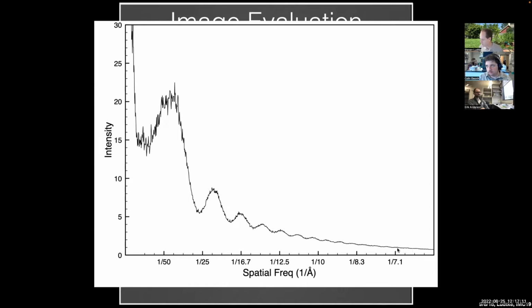So typically what's done in RELION and some of the other packages is a so-called flattening process, where you fit this curve, and then you adjust it so the noise becomes flat. And you've also amplified everything else. You're filtering everything together at the same time, which is unavoidable. And the assumption is that if you make the noise flat, then that's going to produce the desired uncorrelated background noise that you need to work with.